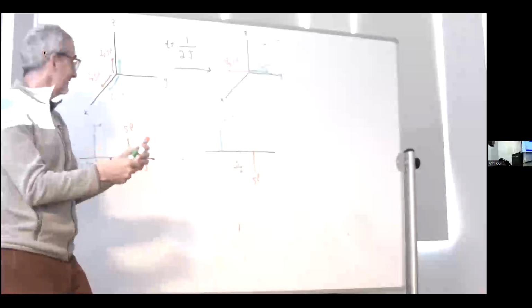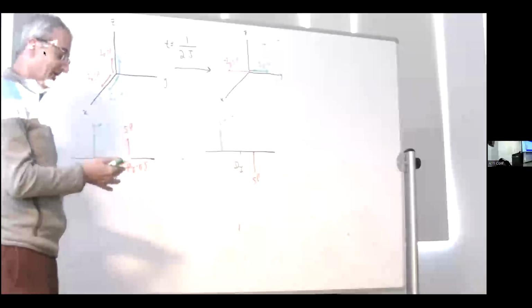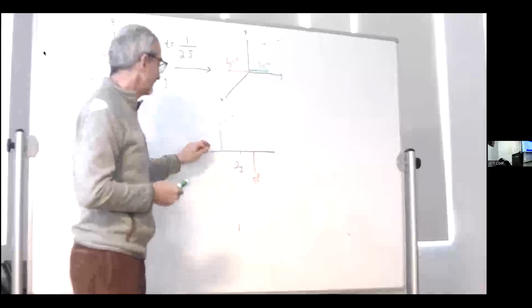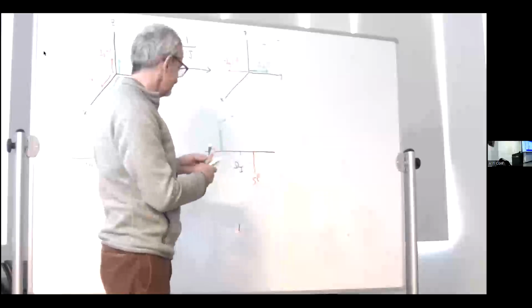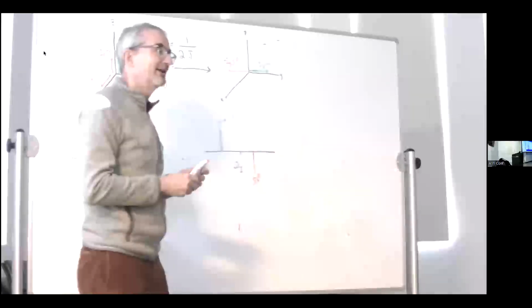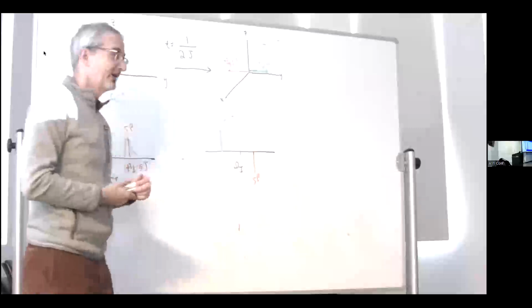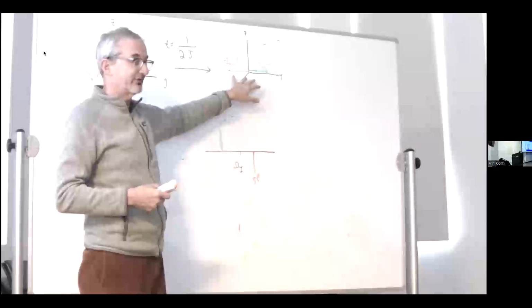Now, in fact, if I had phased these to be absorptive lines, these lines would be dispersive, then they would look more like that. But then I just on the spectrometer apply a 90-degree phase shift and make them look absorptive again. So that part's trivial. So this is what we did before, just to show how this works.